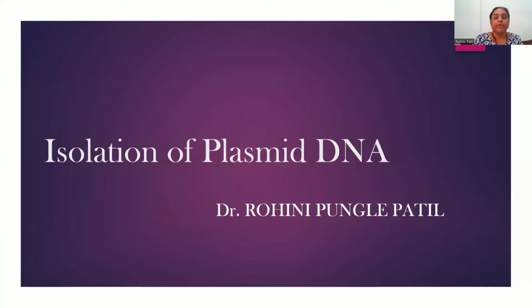So when we have to isolate the plasmid DNA, we have to separate it from the genomic DNA, because the plasmid DNA is a DNA and the genomic DNA is also a DNA. Both of them are deoxyribonucleic acid, so their physical and chemical properties are the same. Here we have to separate the plasmids from the genomic DNA.